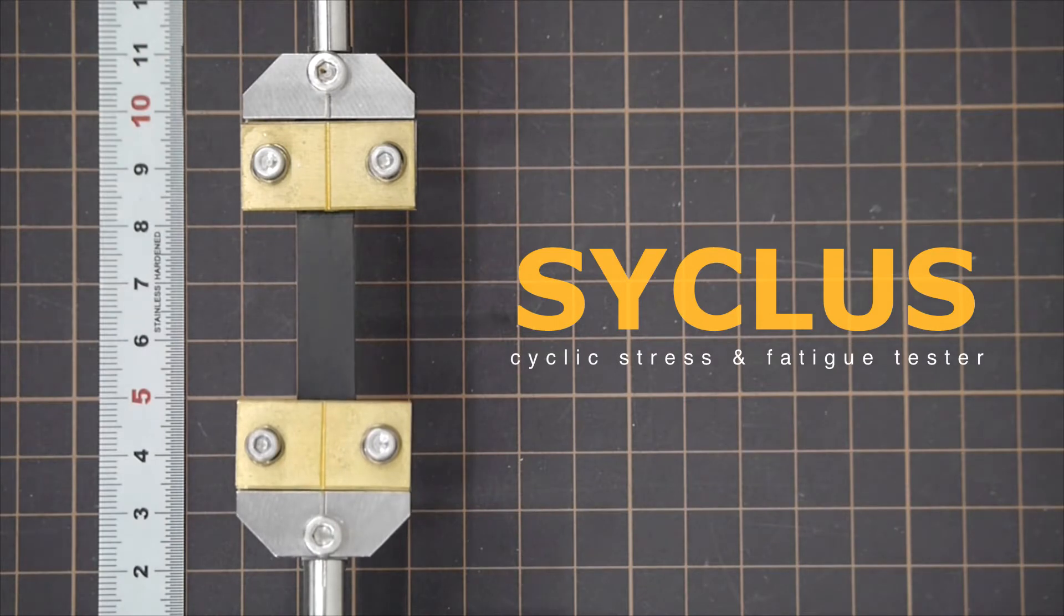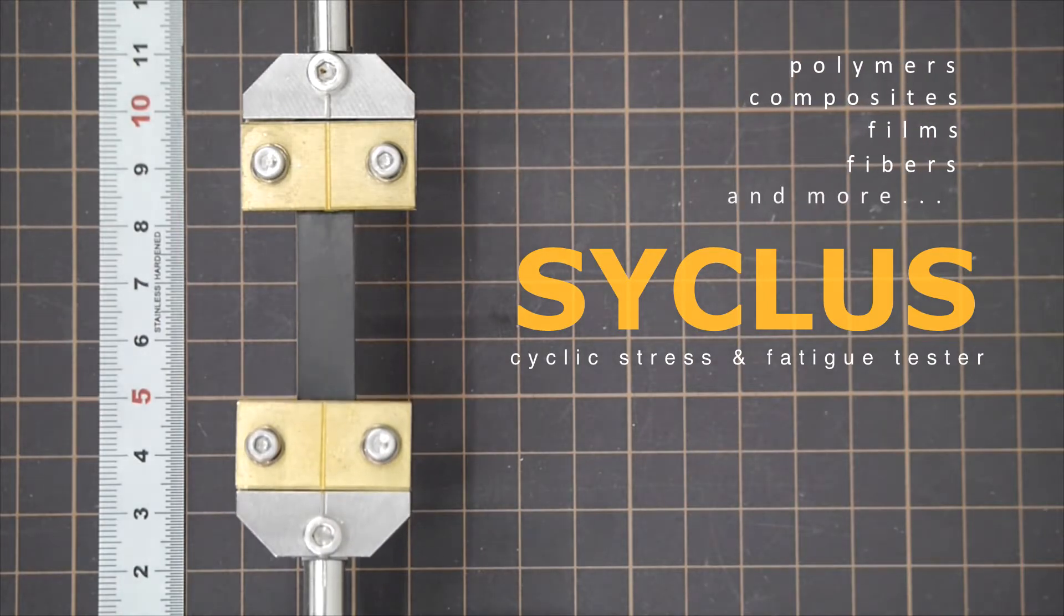Syclus from AcroEdge is a compact and lightweight fatigue tester for a wide range of materials like polymers, composites, films, fibers, and more.